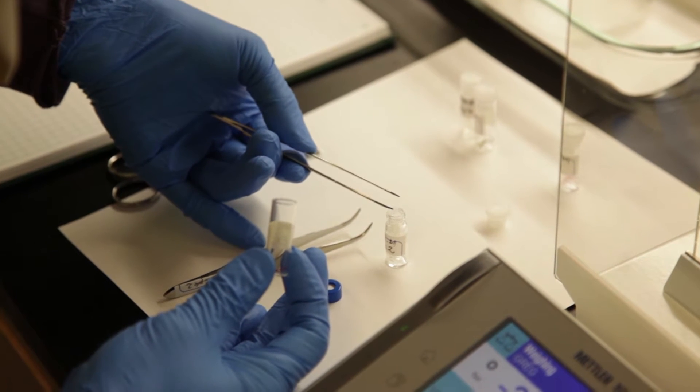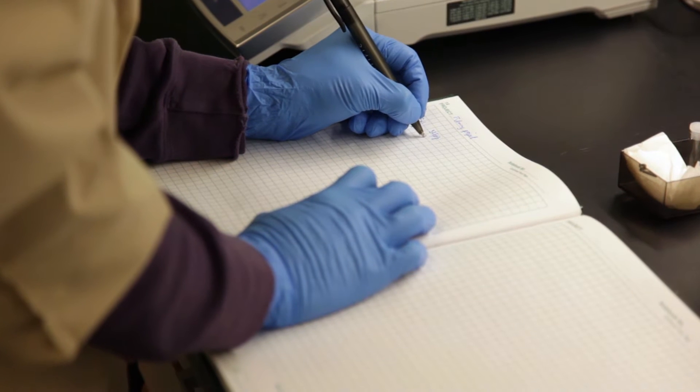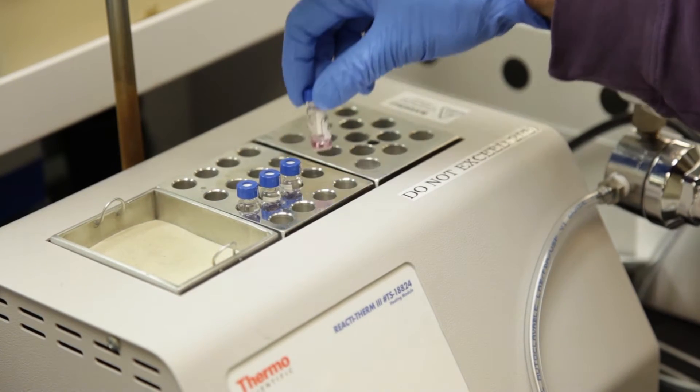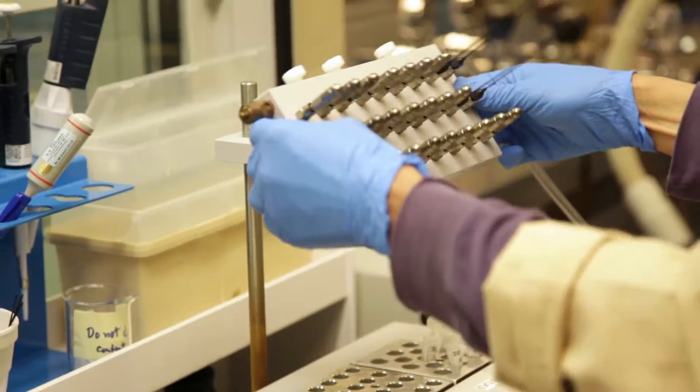Once we have the small fiber we need to extract the dye out. We weigh the fiber to know how much material we're working with. We then introduce the fiber into an acidified solvent solution and heat that, which extracts the color compounds off of the thread and gets them into solution.